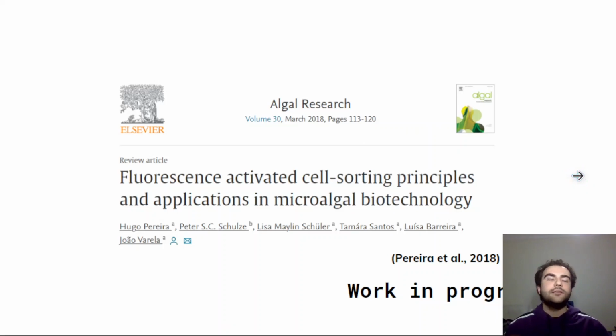And also, as a different type of article, I want to show this one because I think it can influence someone to do further research about it, and it can maybe become their main interest. So, even though FACS based approaches in microalgal biotechnology have been applied in recent years, the current use of this technology has mainly been limited to the search for lipid-rich microalgae.